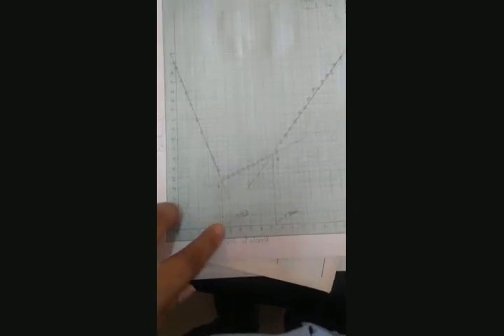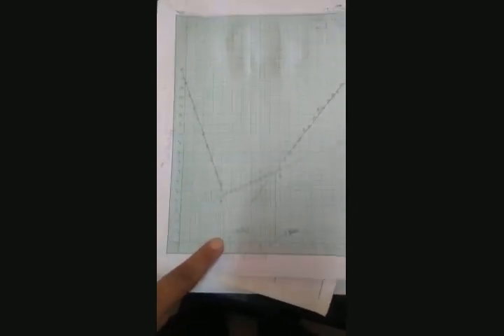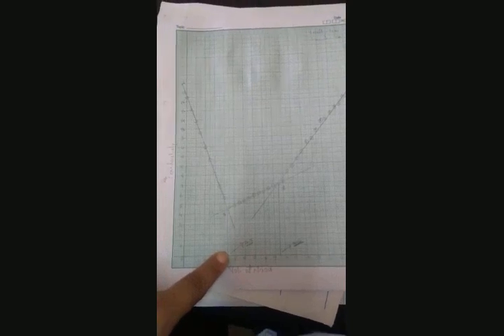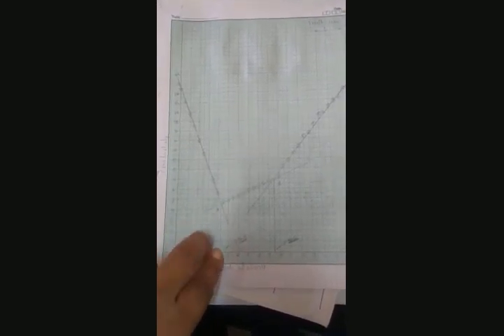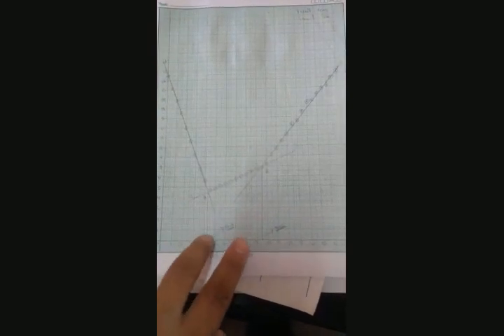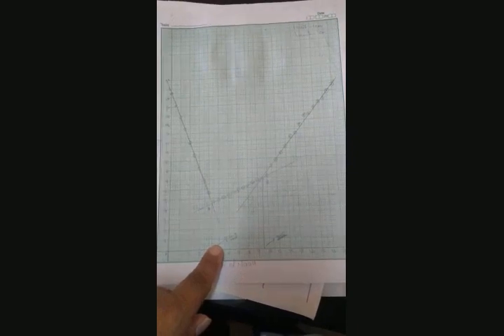Volume V1 corresponds to the amount of NaOH required to consume completely the hydrochloric acid. V2 minus V1 corresponds to the amount of acetic acid.